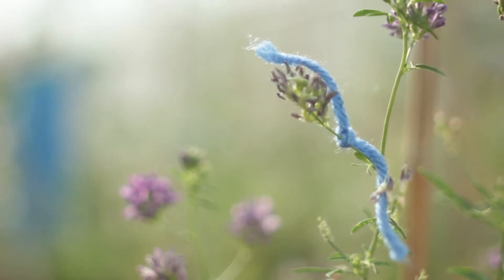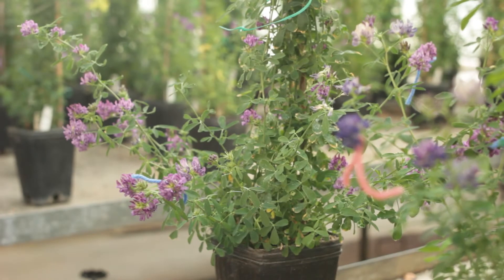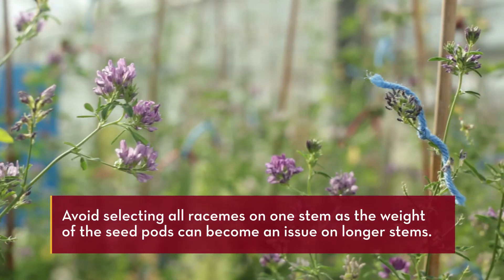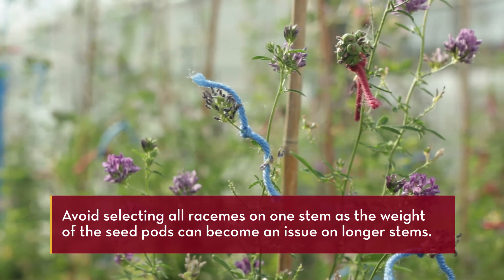Different colors of yarn can be used to code for different crosses or crosses done on different days. Avoid selecting all racemes on one stem, as the weight of the seed pods can become an issue on longer stems.